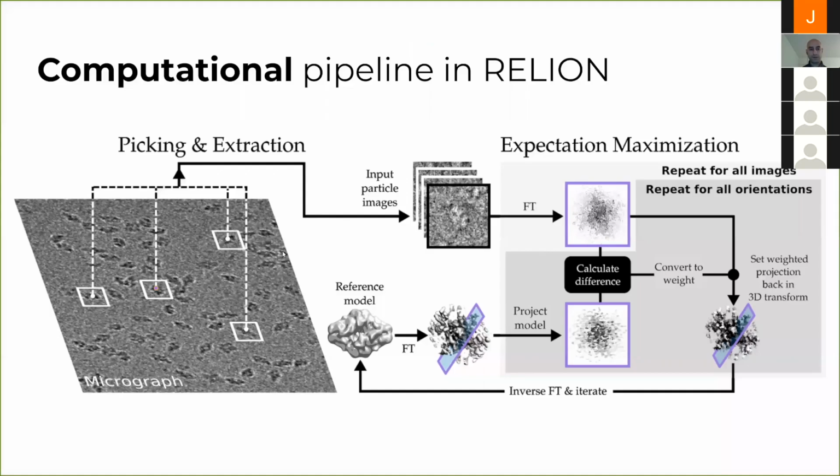It takes care of everything from the entire pipeline of single particle analysis. There's also some tomography in there, but mostly it's used for single particle cryo-EM. And the general pipeline looks kind of like this. You have your raw movies coming in, and you do some kind of motion correction on them and turn them into single images, or micrographs, and then you pinpoint your particles. You extract those as little boxes that contain these particles, as little box images, basically.